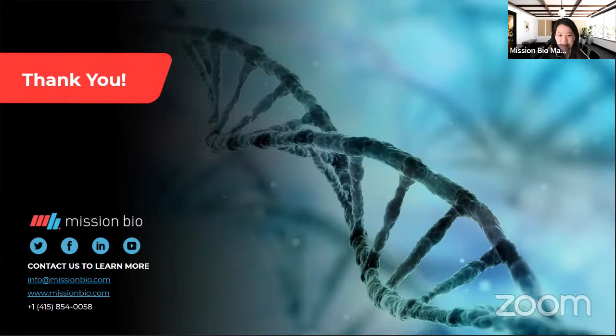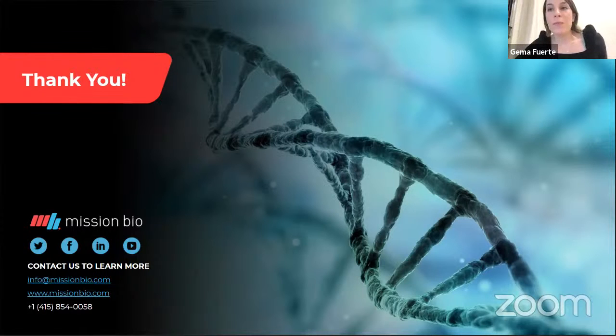All right, it looks like we have another question. Not sure if we can answer this. How do we normalize the protein data? I guess in the Tapestri software. Mm-hmm. For protein expression, I showed different methods. One of them is CLR, centered log ratio. This is typically used for CITE-seq, so for those using CITE-seq, that would be familiar.